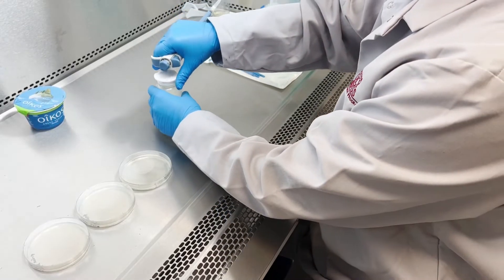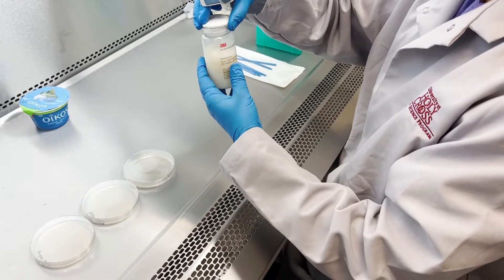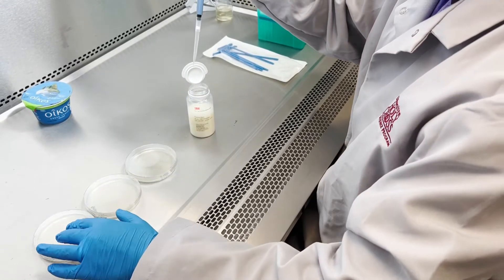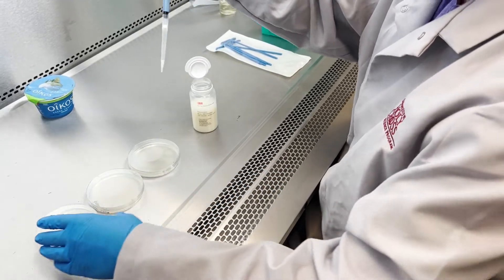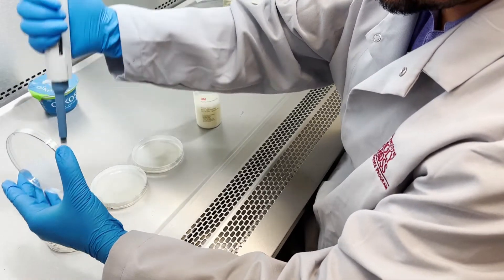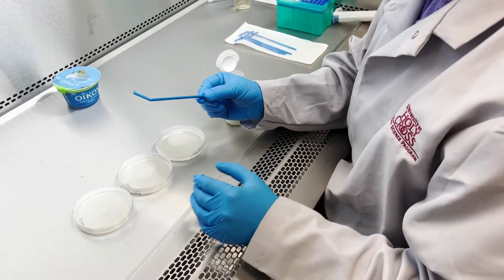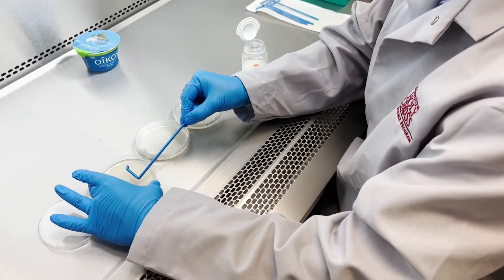Now I'm going to take 100 microliters of the peptone-yogurt sample and add it to the nutrient agar plate. And I'm doing this in triplicate.